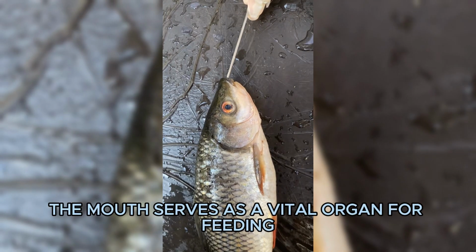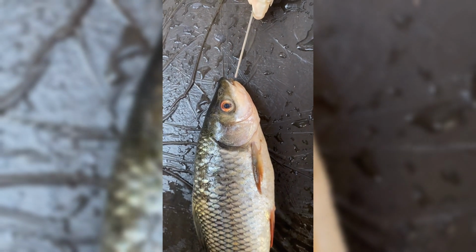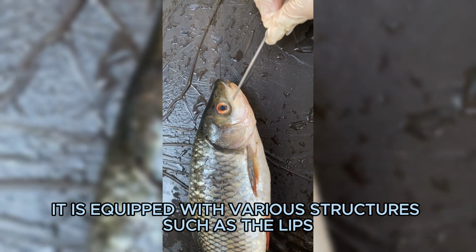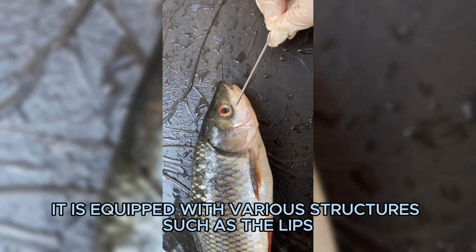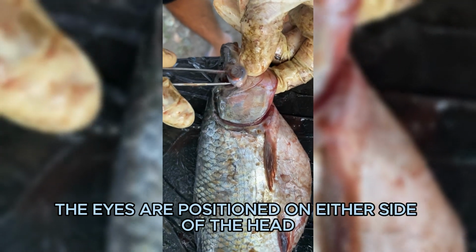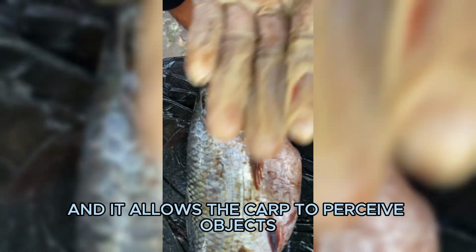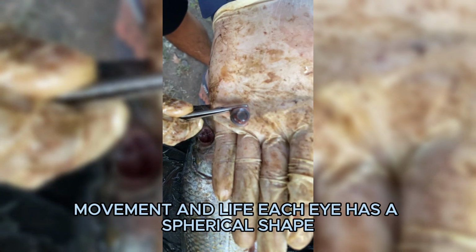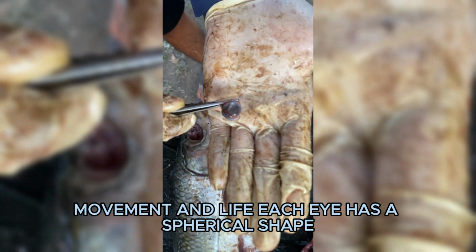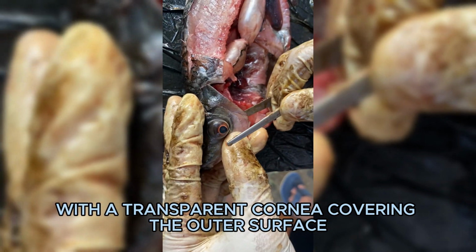The mouth serves as a vital organ for feeding and respiration. It is equipped with various structures such as the lips, teeth, and barbels. The eyes are positioned on either side of the head, and it allows the carp to perceive objects, movement, and light. Each eye has a spherical shape with a transparent cornea covering the outer surface.